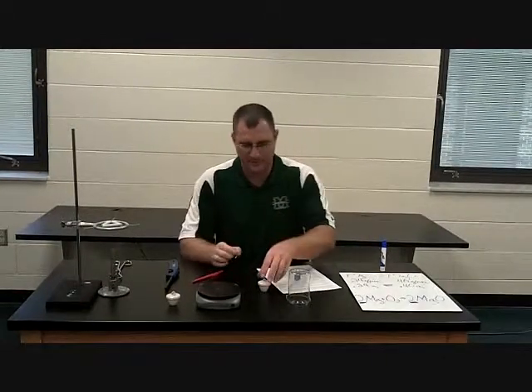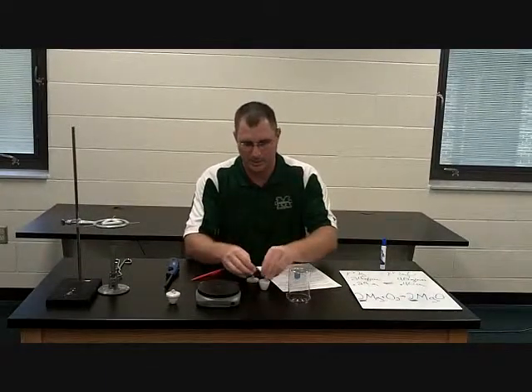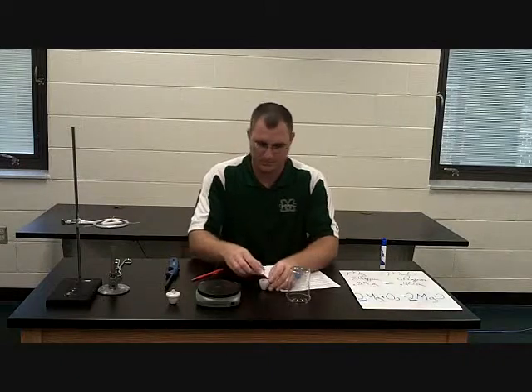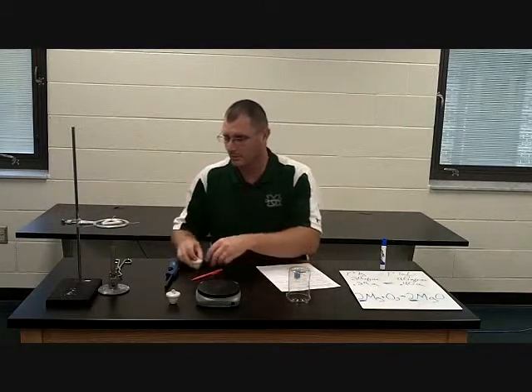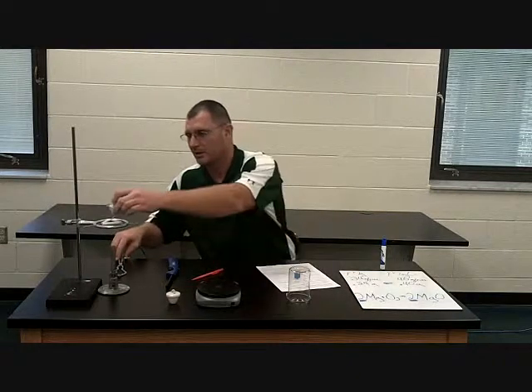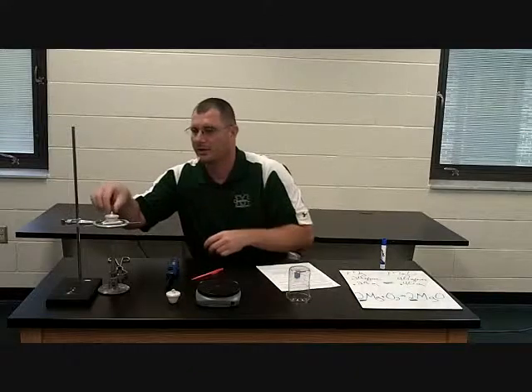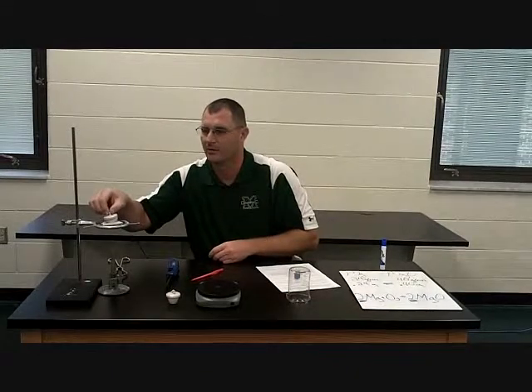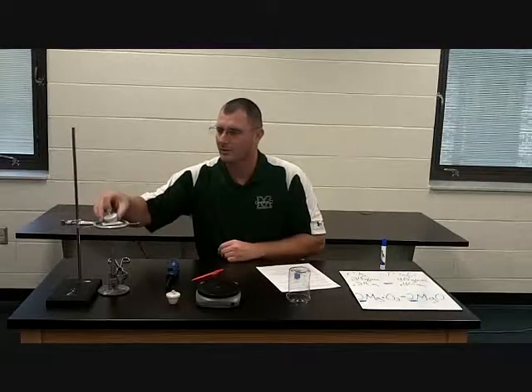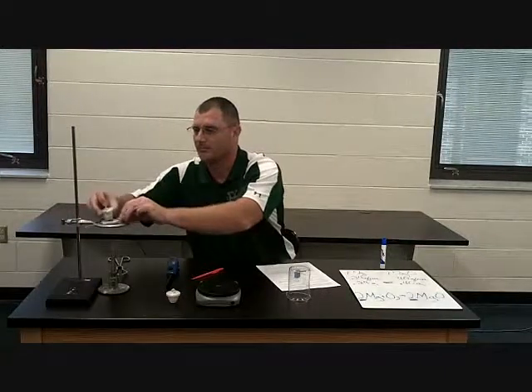So once I do that, I'm going to take my magnesium, and it's okay to bend it, and I'm going to put it in my crucible. I'm going to put the lid on it. Now one thing that's really important, and you'll know why later, is I'm going to put it in here where I can heat it, but I'm going to crack the lid. I want to keep it covering it as much as I can, but I need to crack that lid. We're also using a ring stand and a little ceramic triangle to support it.